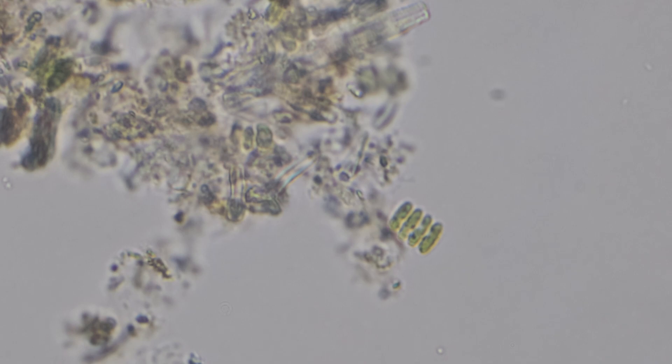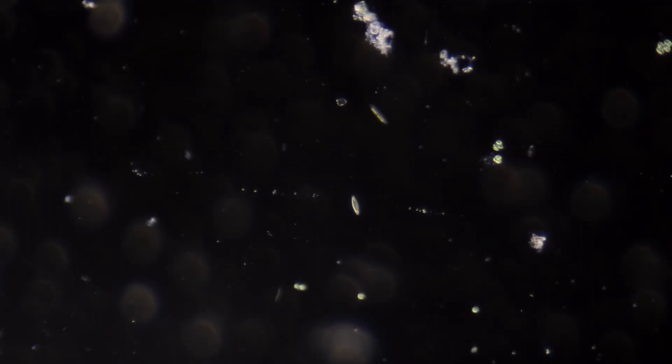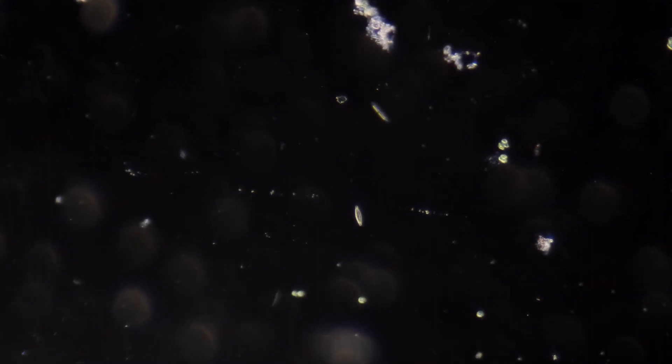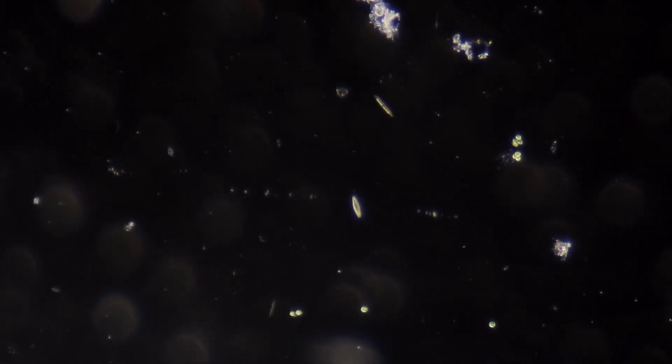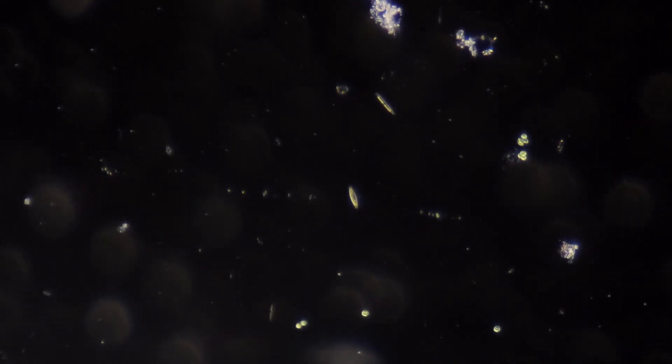It is a rich source of organic matter, and looks to be being picked at by yet another diatom that grows in a chain formation. I came across this particularly mobile diatom, swimming like a living jewel in the dark field of the surrounding water.